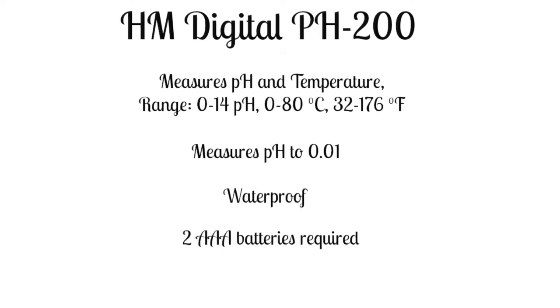It takes two AAA batteries and those are actually included. Apparently this comes pre-calibrated, but I always recommend calibrating your pH meter when you first get it anyway. After that, you want to recalibrate it every single month. Unless you're not using it very often, then you should probably recalibrate it every time you use it.